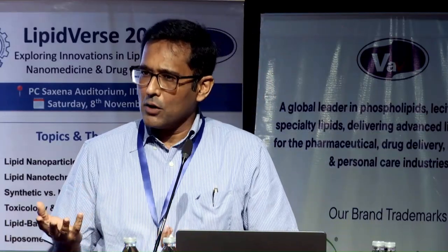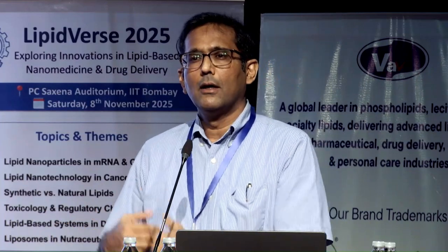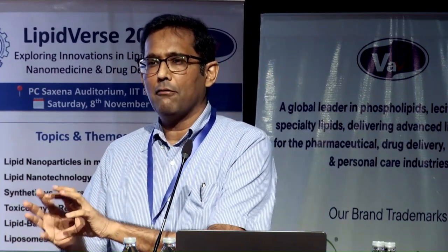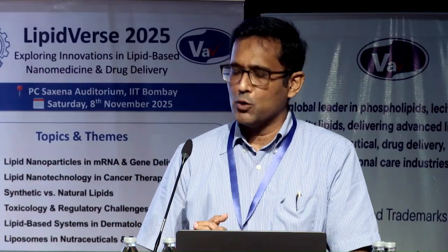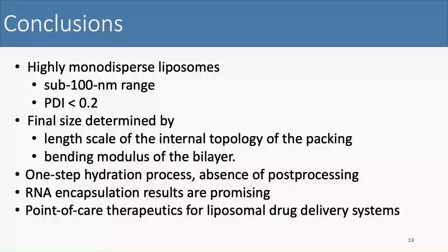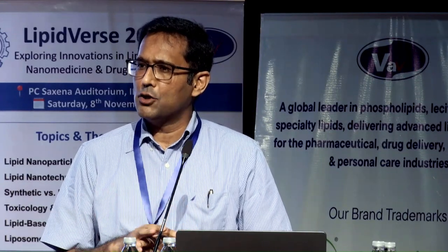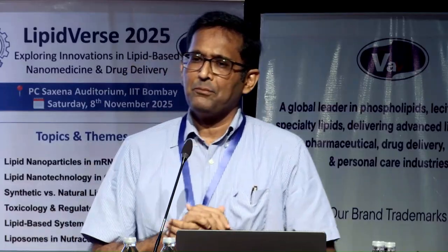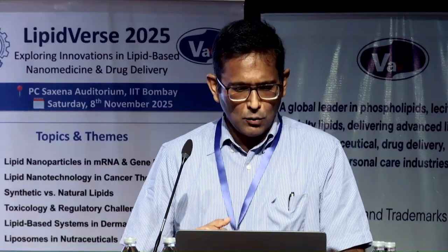It's a one-step process in the sense that you don't have a separation that you have to do later on, where you have to separate the aqueous media from the organic media. So that eliminates, we believe, the post-processing. The RNA encapsulation that is of interest here seems promising from these preliminary results. We really need to optimize it, play around with the ratio of the various lipids, play around with the packing of these particles, change the flow rate, and so on.